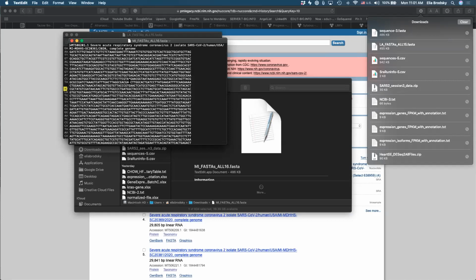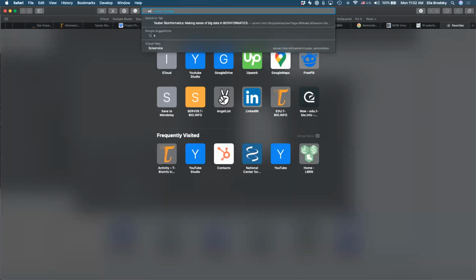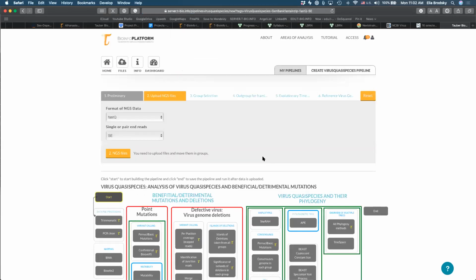Okay, so it's good to think about what your question is before you just jump into analysis, so that your analysis is actually relevant to the type of data that you have. So let's take a look. Now that we have these FASTA files, right? We have two different locations. We selected them arbitrarily. What type of analysis can we do to actually ask the question, how are these two locations different between themselves? So we can look at a number of different questions.